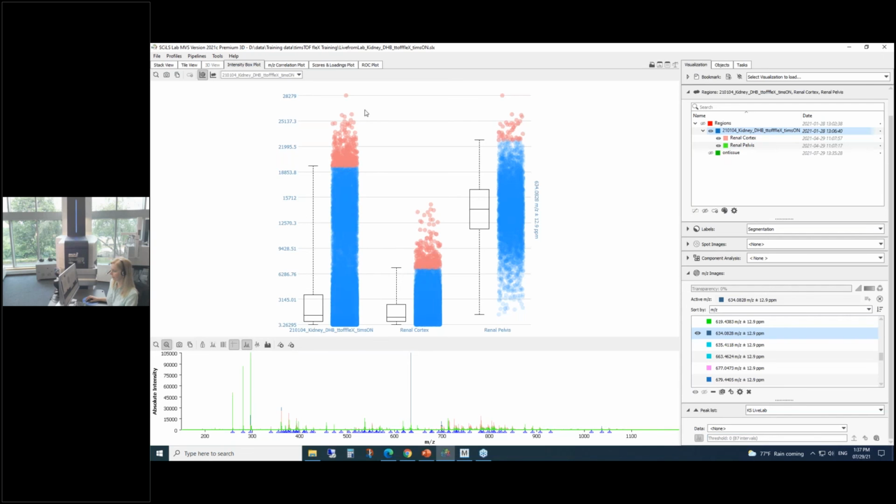The other plot that you see here is what I tend to call a paintball plot. I believe it's technically called a cloud plot. And this represents each spectrum within the quartile limits, so that would be the blue region, and then outside the limits, which would be the red region. So you're essentially looking at these in terms of outliers of your spectra.